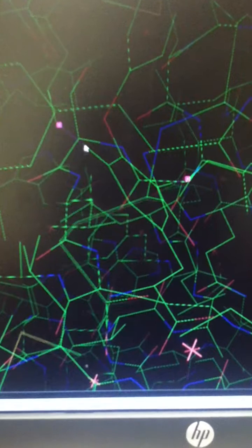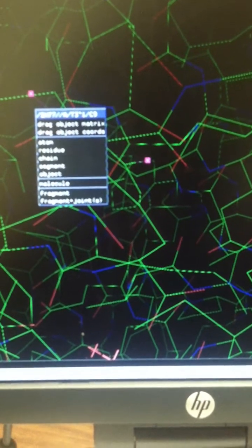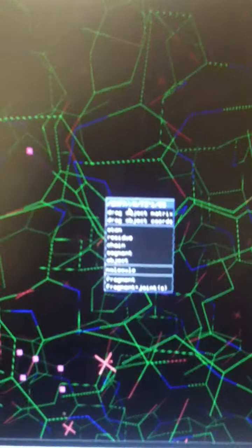Now we want to look at the ligand. What's that called? So I'm going to select this line. It says T31. So whatever comes after the dash is what we need. This is all ligand 1. So again, let me make sure you saw that. Inside of here, this 1 is what I was concerned about.